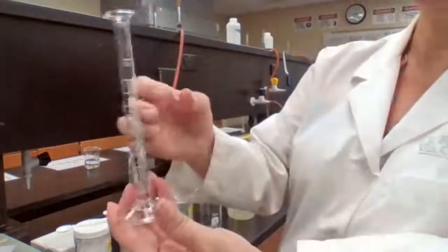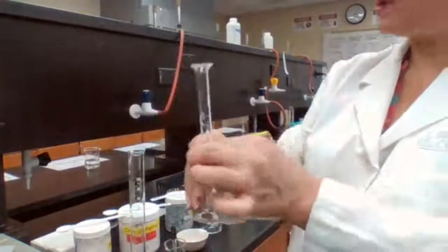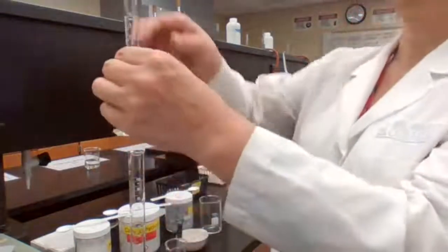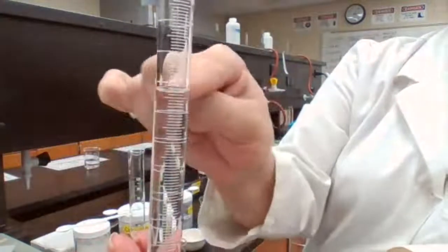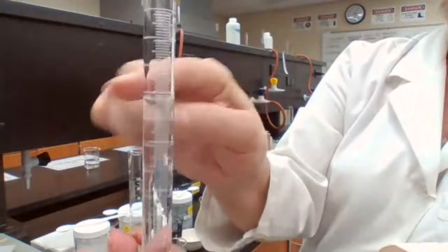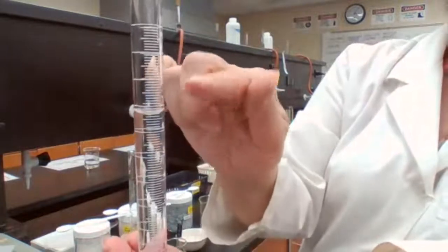It's not plus or minus 1, it's plus or minus 0.1, which is more accurate than the 100 ml one. You have to make sure there's no bubble. There's a bubble here, so we have to wait for the bubble to break. Okay, now we look at the meniscus, the lowest point of the curve. You see the shape of the curve that the liquid makes in a cylinder-shaped equipment. The lowest point is what we are looking for. If it falls between two lines, you have to extrapolate that and record the number.